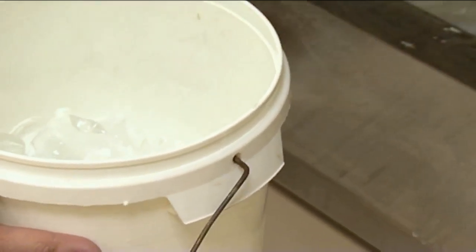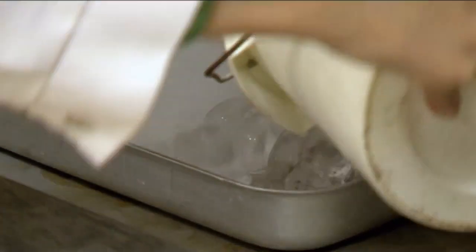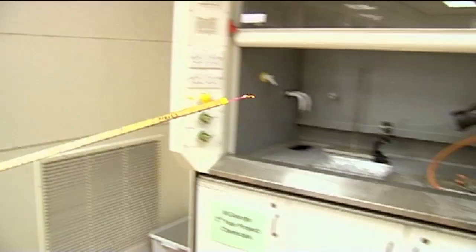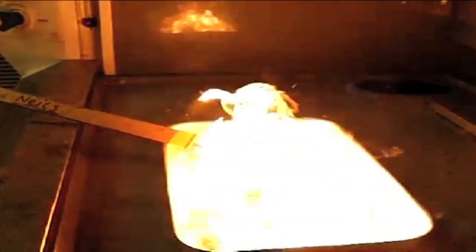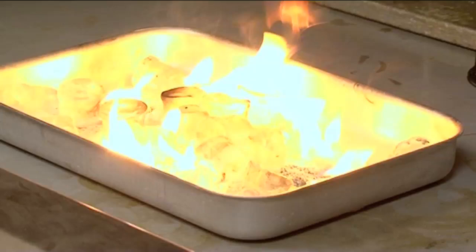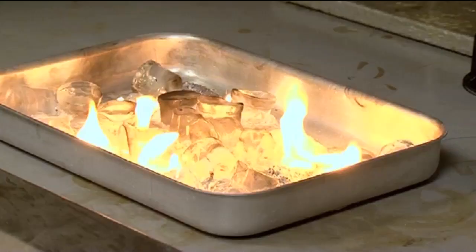We're going to put the lumps of ice on top of the calcium carbide and they're going to react. So I need to be a bit quick with this. We've got the match on the stick and we'll see what happens. So what we have here is the reaction of calcium carbide with the water in the form of ice, and we're getting acetylene gas produced.